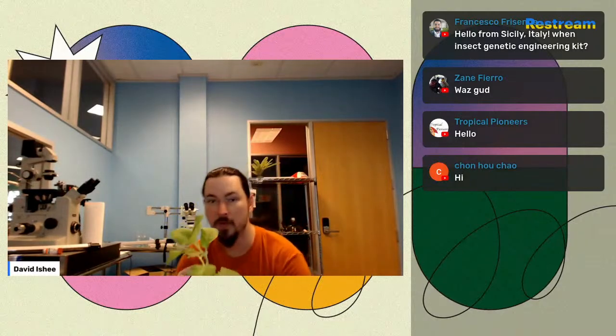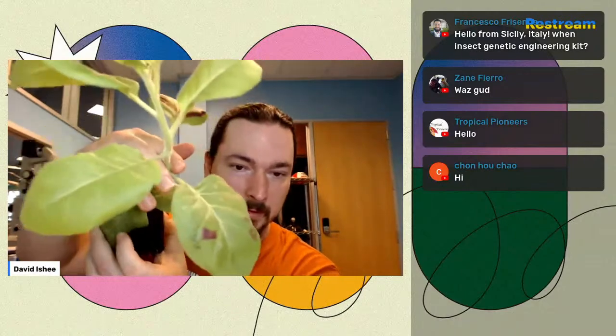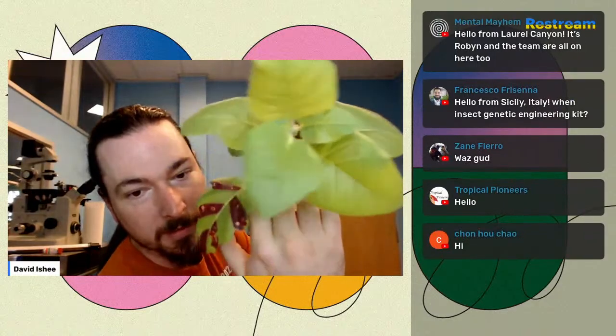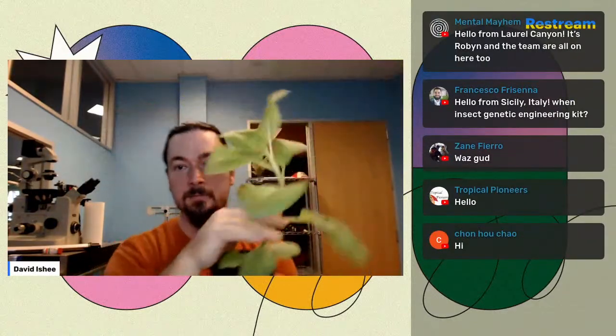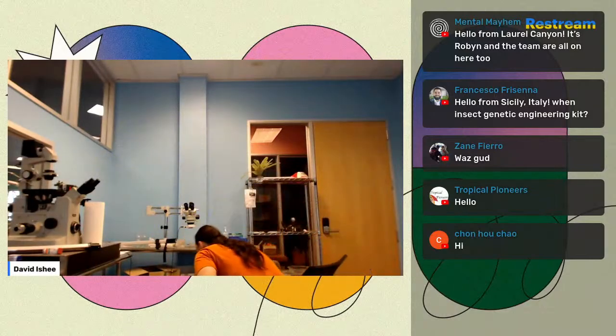So this is one that was done a while back. It's a little tobacco plant. So you can see these spots were modified, and this leaf was modified in several places. Oh man, I can't work with this camera. So, nice. All right.